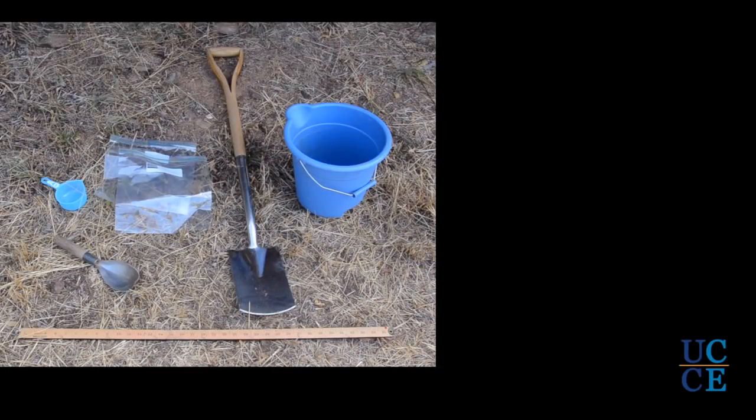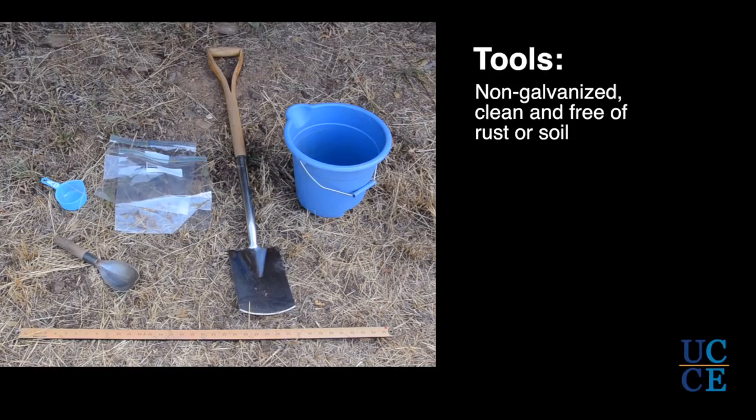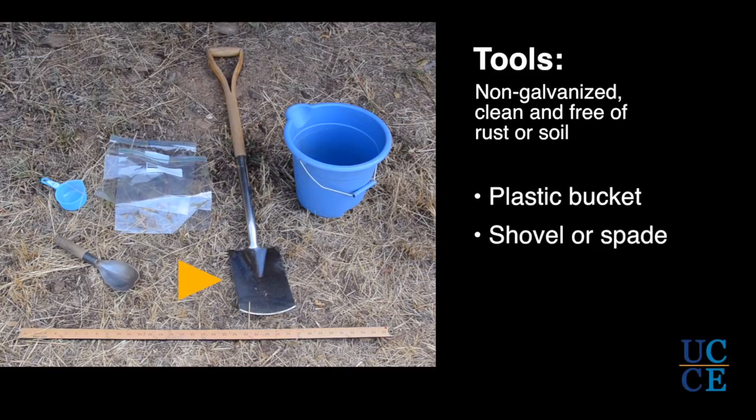To take an accurate and uncontaminated soil sample, you will need the following tools: a plastic bucket. Avoid galvanized buckets as they can contaminate your samples. A shovel, and if using a shovel, be sure it is very clean with no rust or soil clinging to it. A small hand trowel. Be sure the trowel is clean and free of rust and no soil clinging to it.